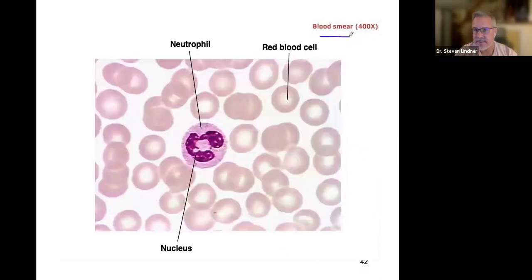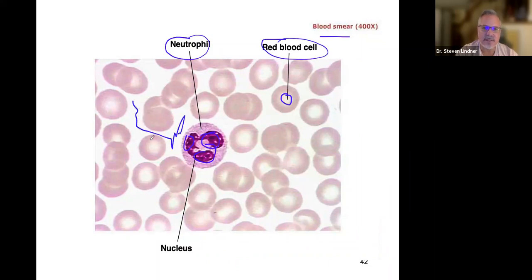This is connective tissue, right? This is blood. This happens to be, looks like 1, 2, 3. When you start to see 3 heads to that, and the granular, 3 to 5 nuclei, it is a neutrophil. These are red blood cells, right? The center is hypochromic. And then all throughout here, this is all plasma. All this liquid here is plasma. So you have cells that are scattered far apart. They're not together like epithelium. That's what makes it connective tissue.